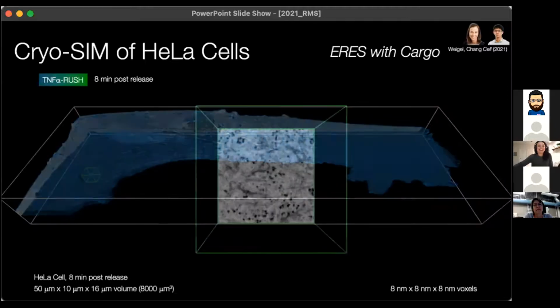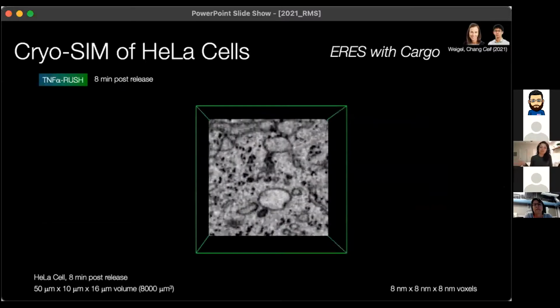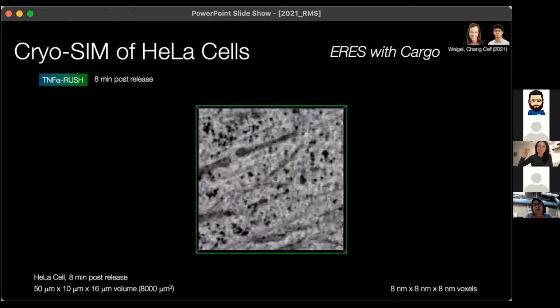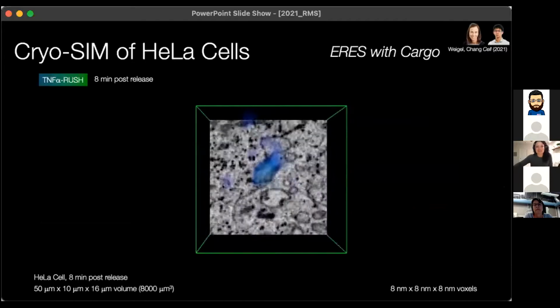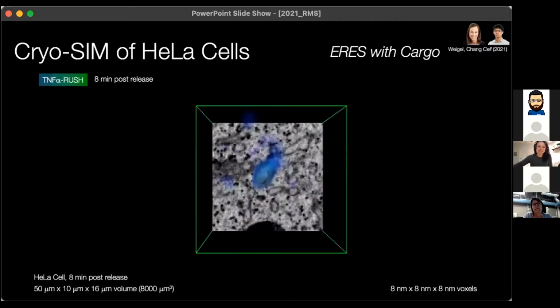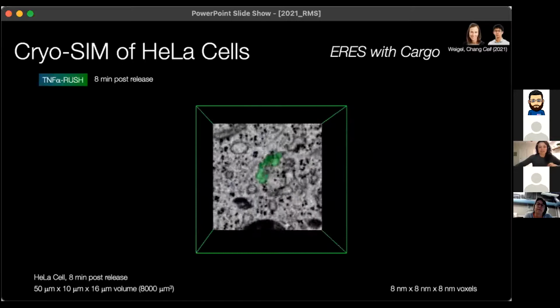So if we zoom in, you can see that, again, as in all the other data sets that I've shown, it's full of membranes and ribosomes and cytoskeletal structures. And you may notice in the center that those little bubbles that look like the ER exit site popped up. If not, we can turn on the RUSH cargo, which will fill up that exit site. And you can see it right here. And if it's still hard to see, we've also turned on the segmentation here, which will come up in the next pass through. So you can see the exit sites connected to the ER, which is kind of moving all around in that area. The exit site itself is segmented in green now.